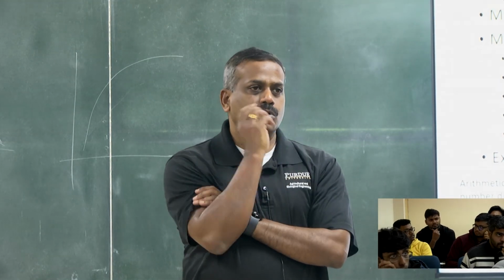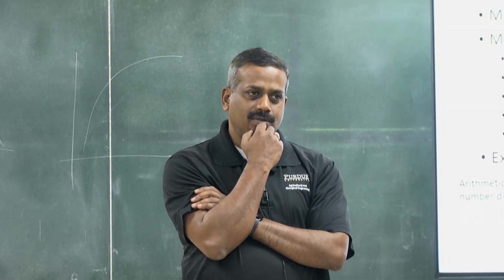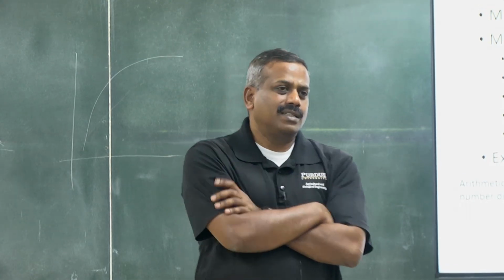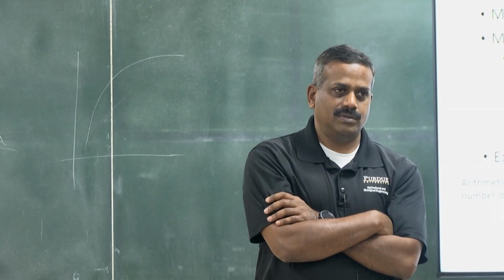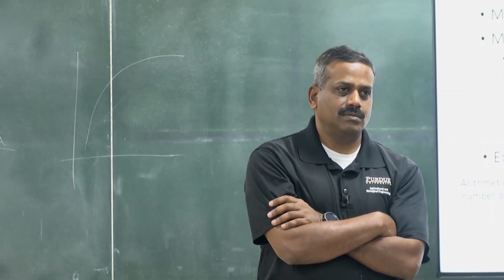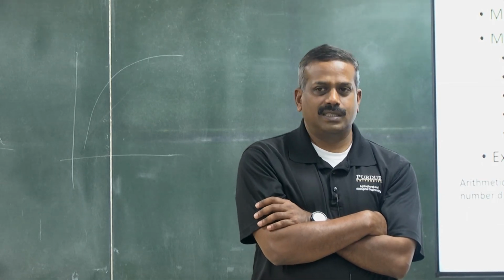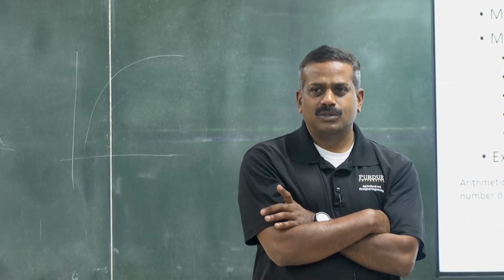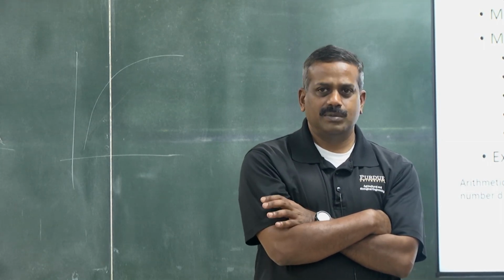We'll talk about powder flow, and I think I will have some examples there. There is lots of research work done on particle size distribution and flow. You can do some simple simulations too, like DEM, taking different particles. Do any of you know DEM other than you? Discrete element method modeling.